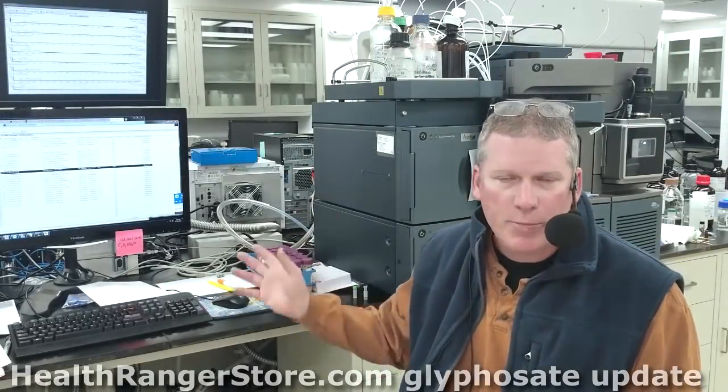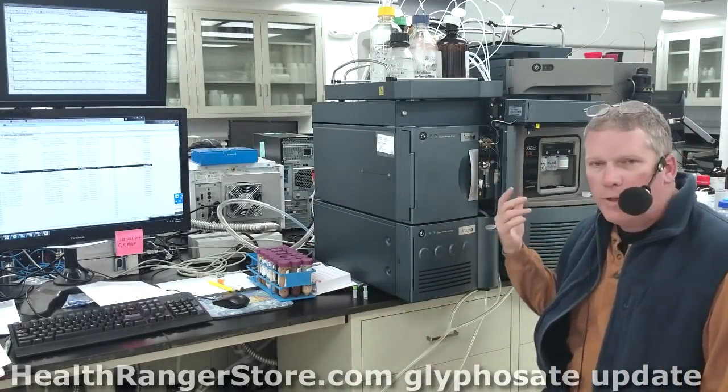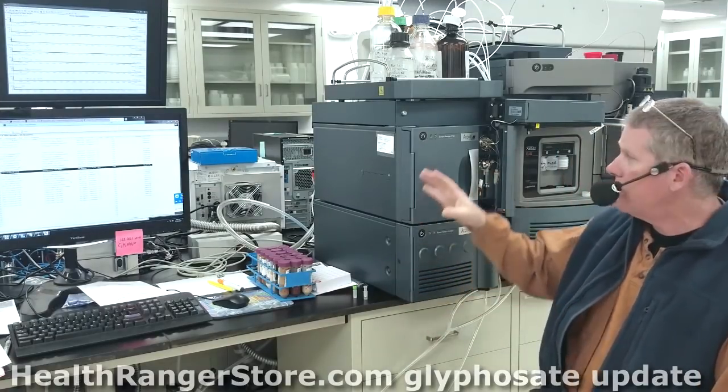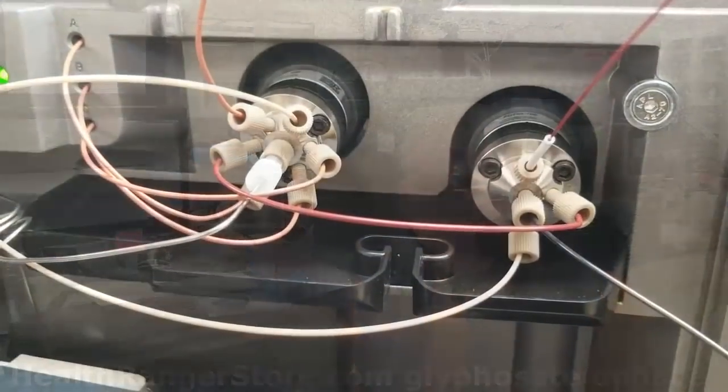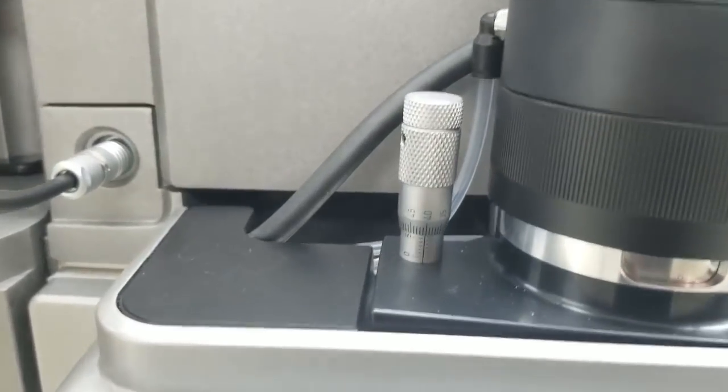This is the instrument here. This is a triple quad mass spec instrument. I've given a tour of this in a different video to explain how everything works. It's a combination of liquid chromatography plus triple quad mass spectrometry. We're doing ion fragment analysis and quantitation of the glyphosate molecule using the 168 to 63 transition, using 2 quadrupoles plus a collision cell to get the ion fragment fingerprinting. And we're doing a confirmation ion at 150. So those of you who are scientists who know what this is, you know that I'm describing the best method that's currently known to quantitate glyphosate in negative mode. Of course, this is running in negative mode because that's how you get ionization of glyphosate.